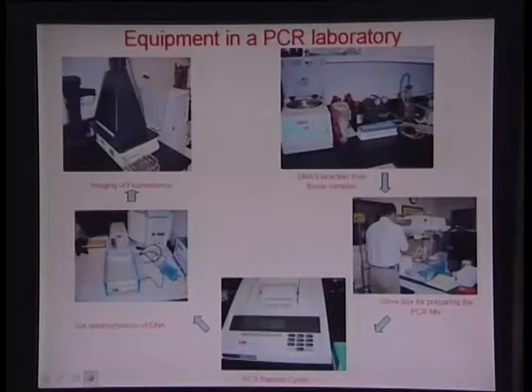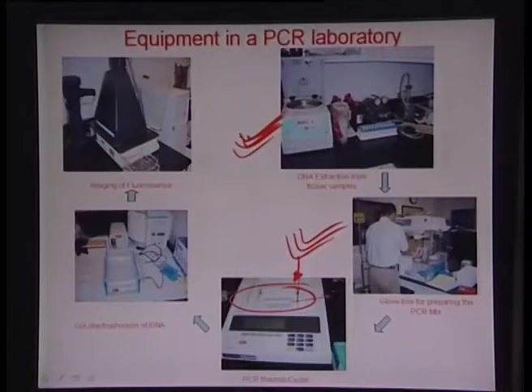So in a conventional system, as you know, in the laboratory you typically have a PCR machine. Initially you have a DNA extraction machine where cells are lysed and the DNA is subsequently captured on filters. You have a PCR machine illustrated here. This is what a normal thermocycler would look like. There is a huge aluminum block here which can be used for doing more than one sample and make the process high throughput, but the overall time here is much higher.